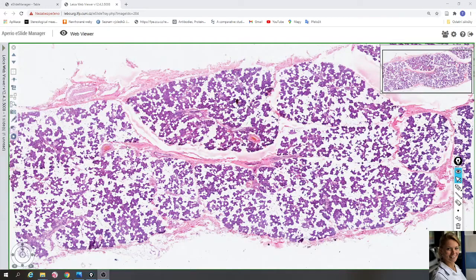In this video we will take a look at the slide of parotid gland. The slide is stained with hematoxylin and eosin, which means that nuclei of cells are violet and cytoplasm is pink. The parotid gland is a large serous gland that is classified as a compound tubulo-acinar gland.